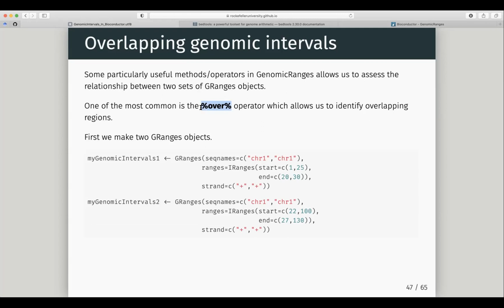It lands somewhere overlapping this range. This is a really cool feature of Genomic Ranges, and obviously fundamental when we want to work with alignments and assign scores from one set of ranges to another.